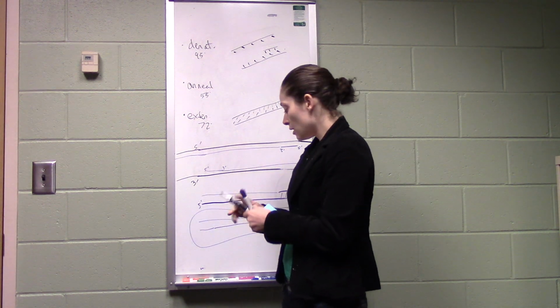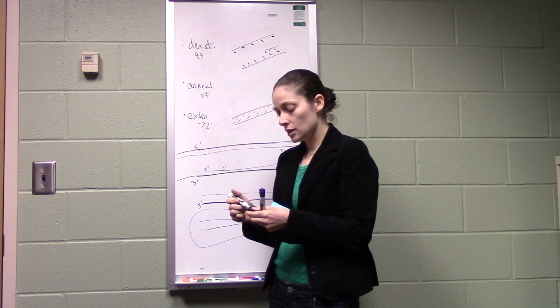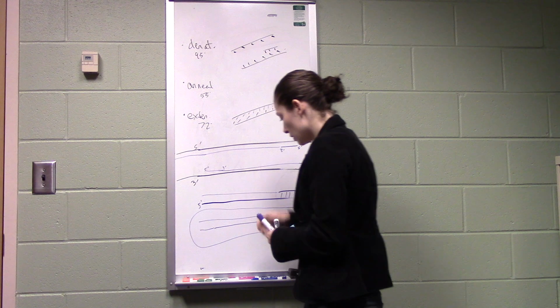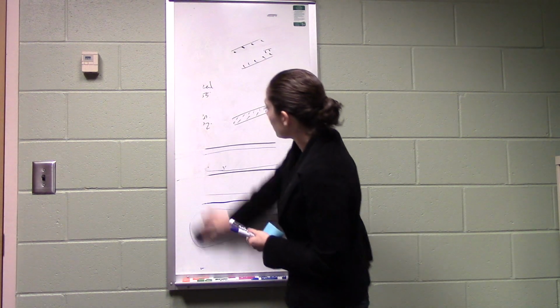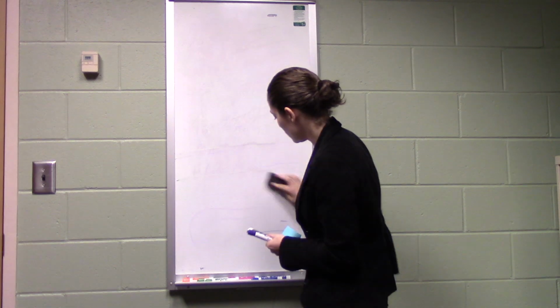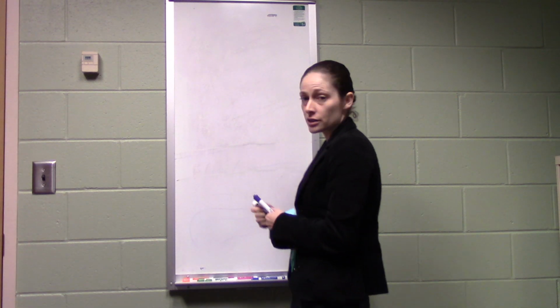All right, so after our PCR, we used a DNA gel, an agarose gel, to visualize our product. So important with DNA gels are that they separate DNA based on size, and how they do this is by using the negative charge of the DNA.